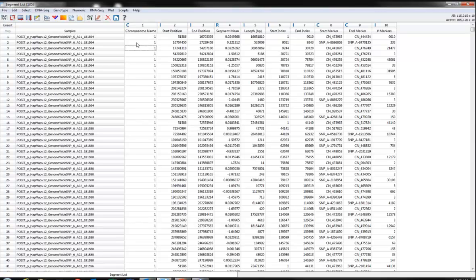But you can see here with this first sample, on chromosome 1, this index tells you the first marker to the 9,010th marker. Across that entire length, the average log ratio is really close to 0. Then for the next 233 markers, the average log ratio creeps up a little bit. It's about 0.2, which is getting to the point where it's consistent with maybe having 3 copies. But then for the next 21,000 markers, it's back close to 0 again.